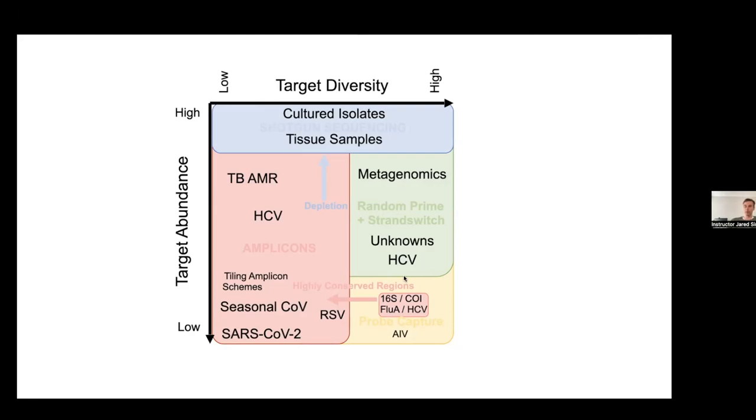Ian, do you have a question? I just wanted to give some feedback about the priming for the RT step. The original amplicon protocols for Arctic amplicons all use a two-step reaction, which is an RT with random hexamers and oligo dTs mixed. But we have switched to a one-step PCR amplification, and so that RT step uses target-specific primers for the RT. Great, fantastic. Thanks for that additional comment.